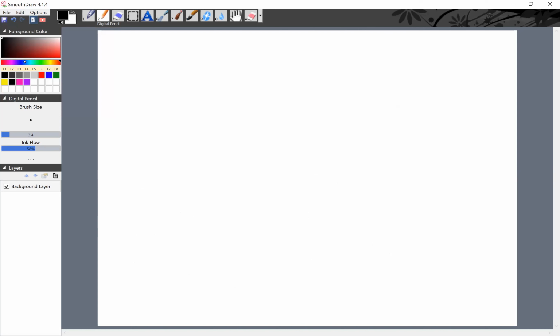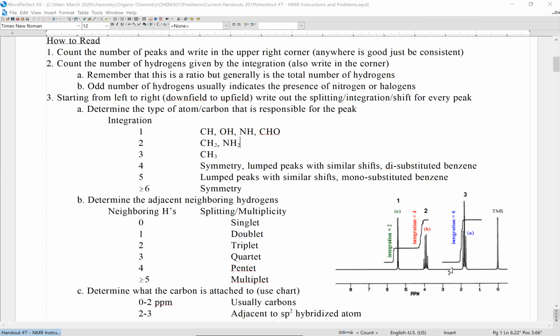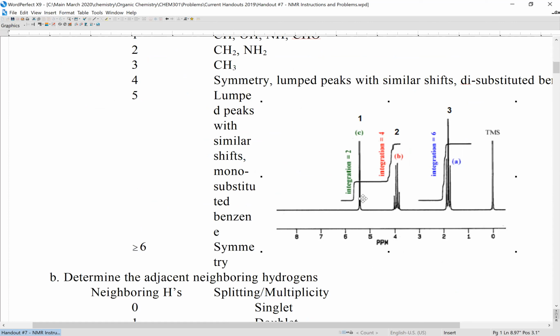I'm going to pull up the handout. Now these right here, aren't they perfect? Now I know it's tiny. Roll it up. But there, it integrates for two. What would we call that one? Now, it's all about the interpretation, and the spectra are not beautiful, so we don't fall in love with anything, but you make your best guess.